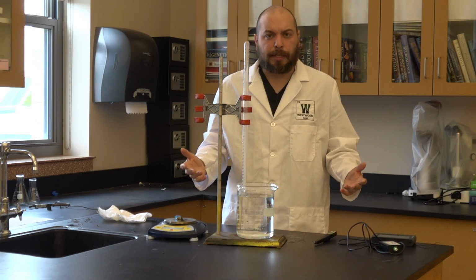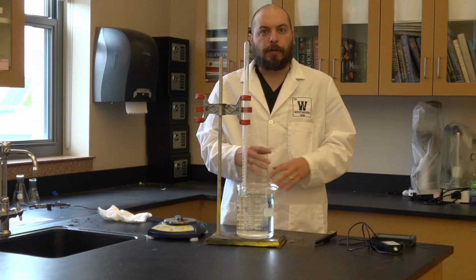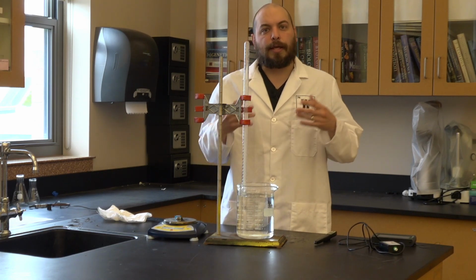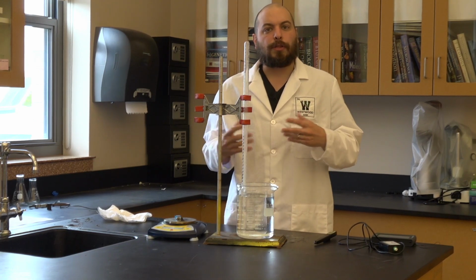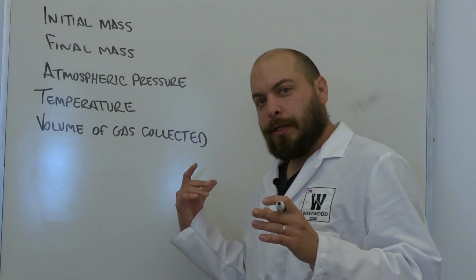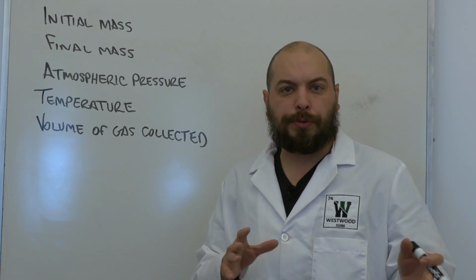So in terms of technique, it's a fairly straightforward lab. In terms of error, however, there are a lot of sources. All right, so let's go ahead and now talk about what data we collected, and then also how the sources of error might show themselves throughout the process. So now that we've collected our data and I've taken you through the procedure, let's talk about how we're going to use it.